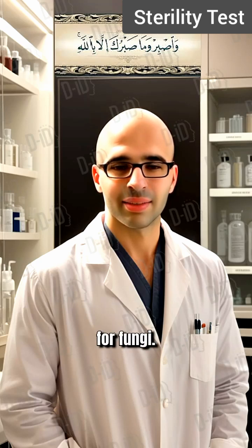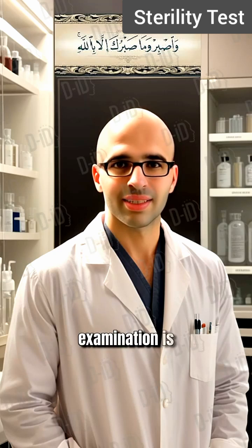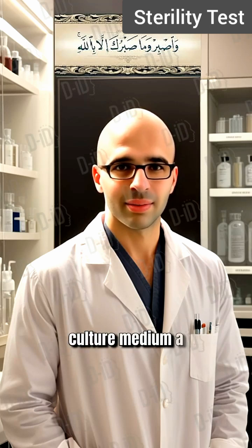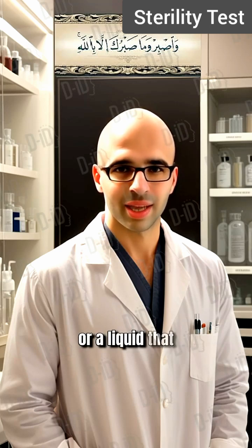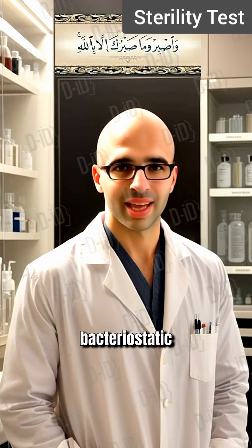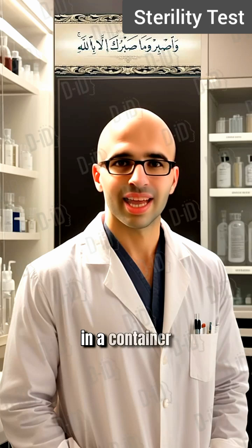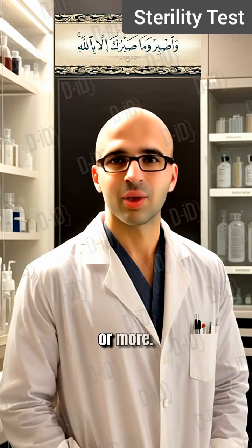Membrane filtration is preferred where the substance under examination is an oil, an ointment that can be put into solution, a non-bacteriostatic solid not readily soluble in the culture medium, a soluble powder, or a liquid that possesses inherent bacteriostatic or fungistatic properties. It is also used for liquid products where the volume in a container is 100 milliliters or more.